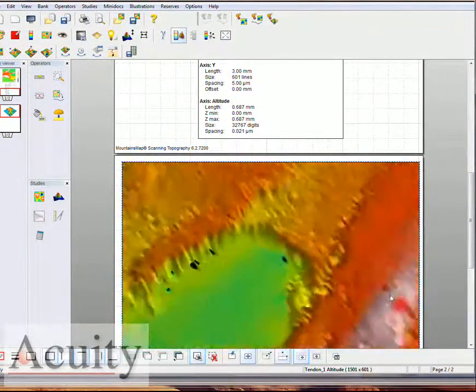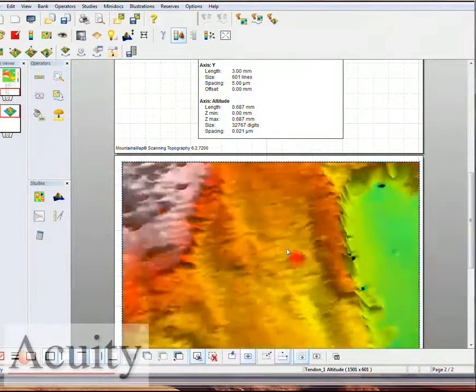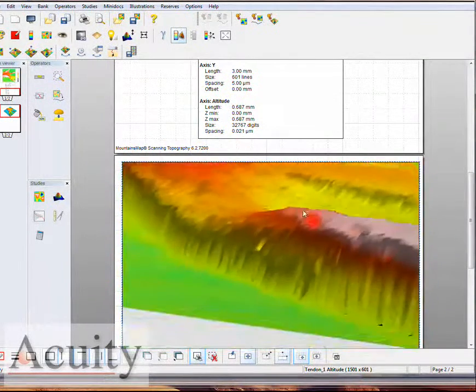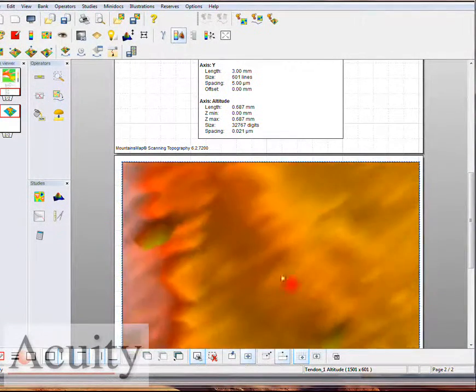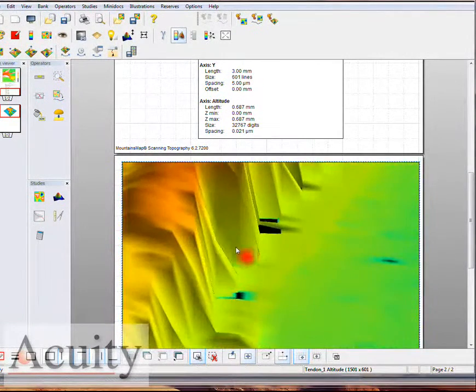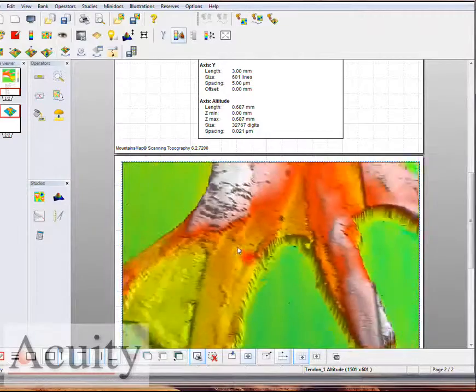Using our white light confocal CL3 probe, so no doubt that we're getting good measurements. You can kind of get a feel for the actual resolution that we are seeing on this target surface.